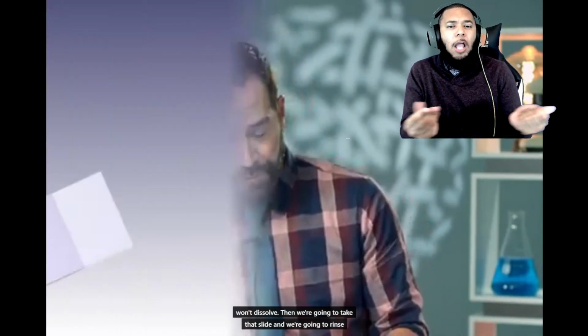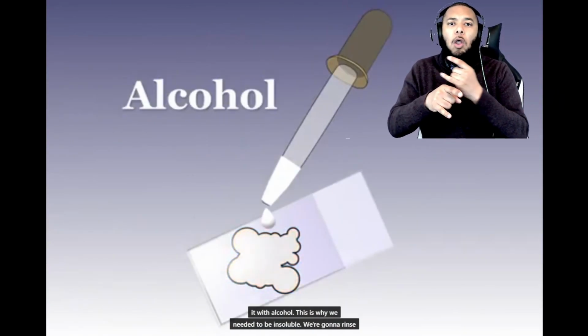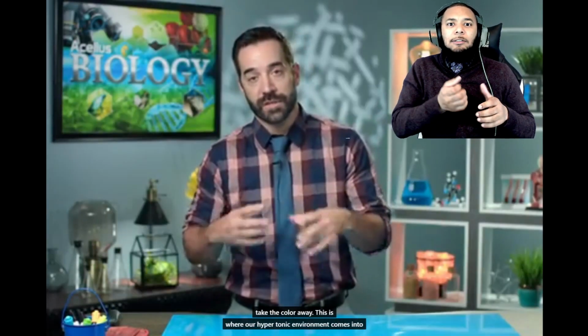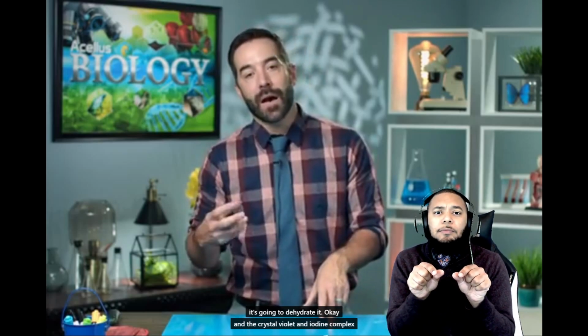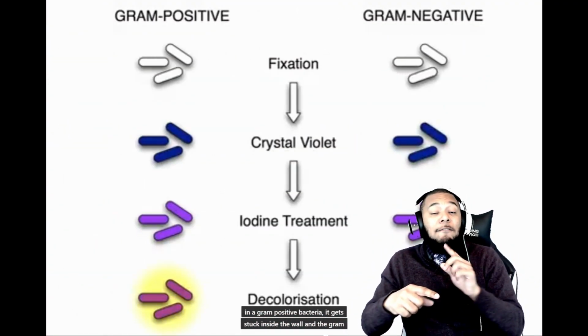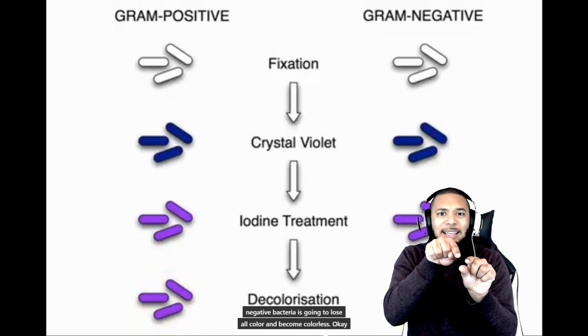So the iodine binds with the crystal violet, and that makes it so it won't dissolve. Then we're going to take that slide and rinse it with alcohol. This is why we need it to be insoluble. Alcohol is a decolorizer, right? The alcohol is going to take the color away. This is where our hypertonic environment comes into play. Once we add the alcohol, that is going to shrink the cell wall and dehydrate it. The crystal violet and iodine complex in a gram-positive bacterium gets stuck inside the wall, and the gram-negative bacterium is going to lose all color and become colorless.